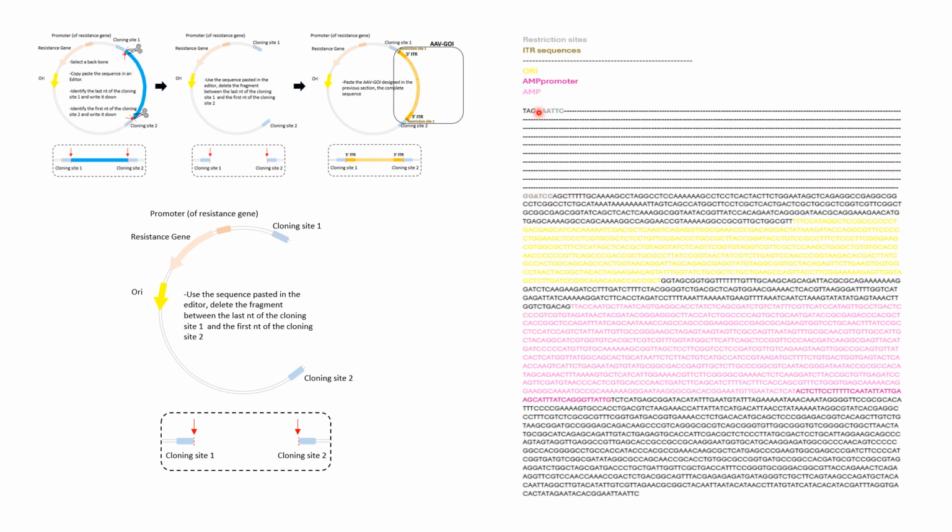this blue sequence? So the only thing that we have done is just deleting, pressing the delete button, and that's all. We haven't done anything else. So let's go for the next slide that is going to represent this third step. Okay, let's go for it.